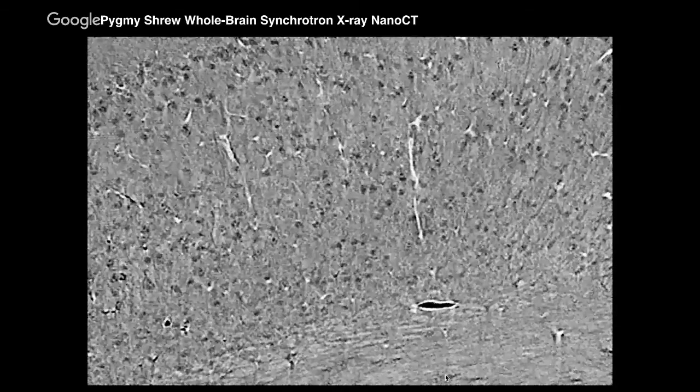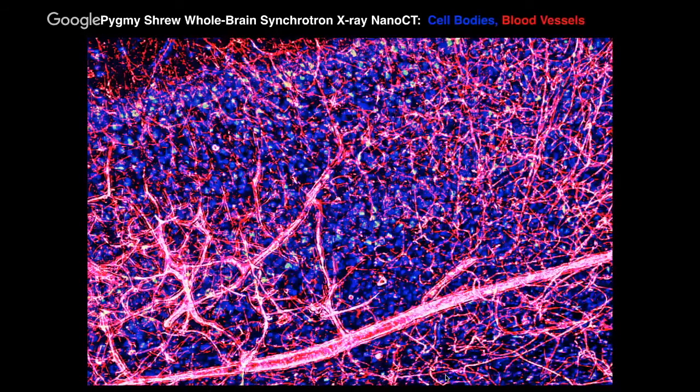Now that's fine, but what's interesting is, this is showing if you use a lookup table and just color code pixels and do a projection type image. So this is just identifying the cell bodies in blue and the vasculature in red. And again, there's nothing here except using a lookup table to color code things according to the grayscale intensity level.